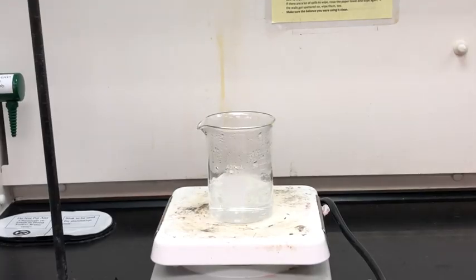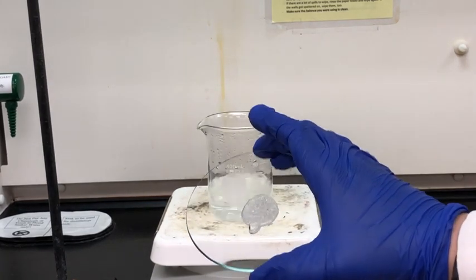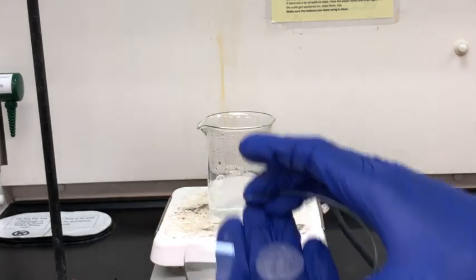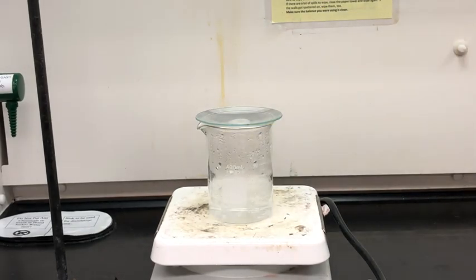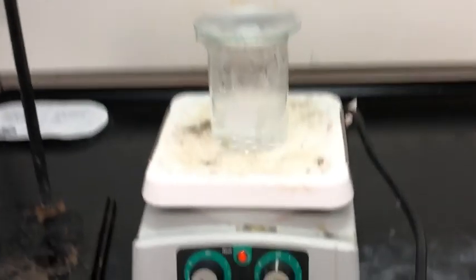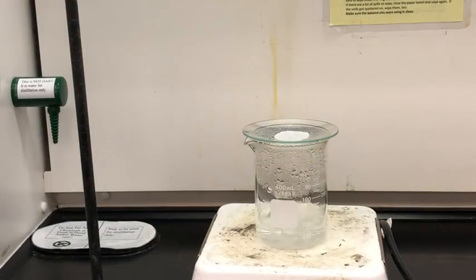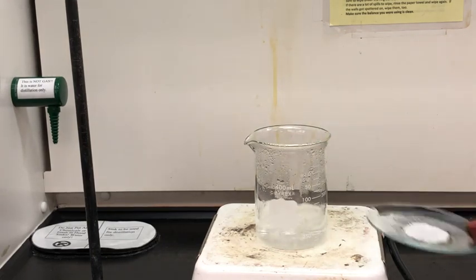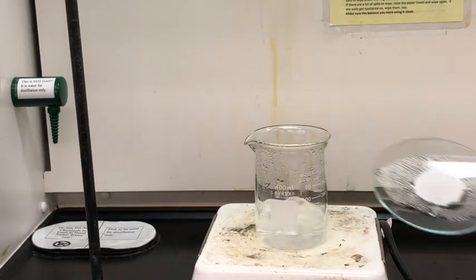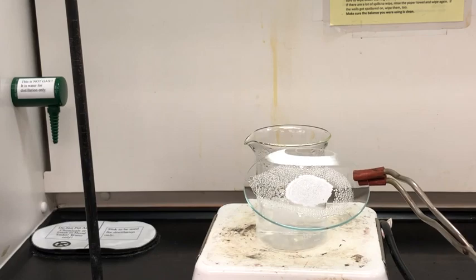To speed up evaporation of the liquid we're going to place our watch glass with our sample on top of the beaker with the boiling water in it. This should allow any leftover water to evaporate away, just leaving our solid sample. After a few minutes we remove the watch glass and we mostly just have solid on top. There is some moisture on the bottom from the boiling water so we'll wipe that off with a paper towel.